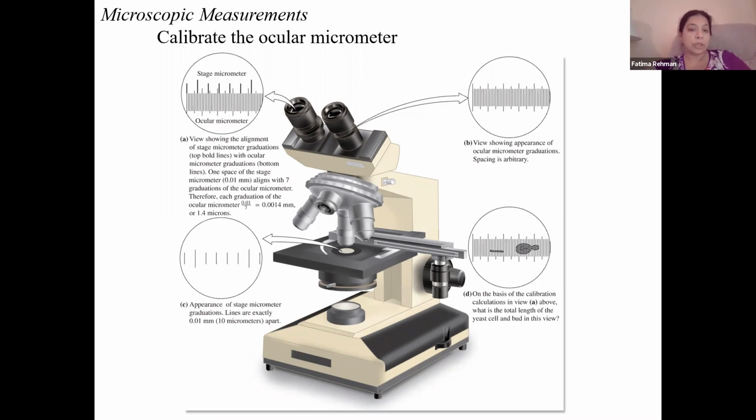and bring it into the resolution you want. Once that is done and you move from your scanning objective lens to your next objective lens, the only knob you should use is your fine tuning knob to fine tune your focus. You should not have to use the coarse focus. If you're having to use the coarse focus, you should be going back to the scanning objective lens and restarting to make it focused initially.